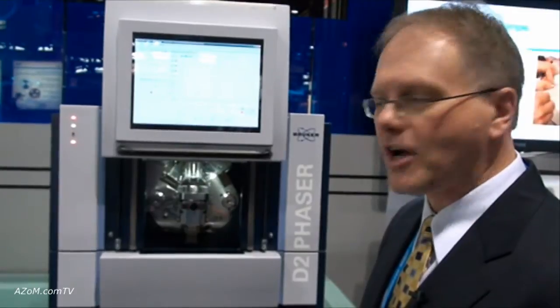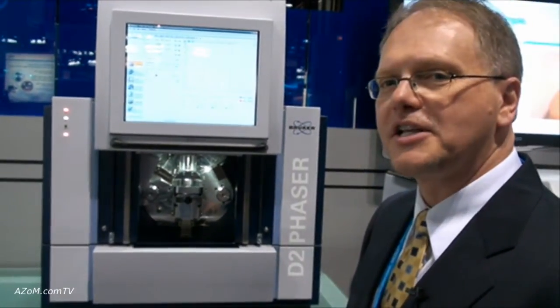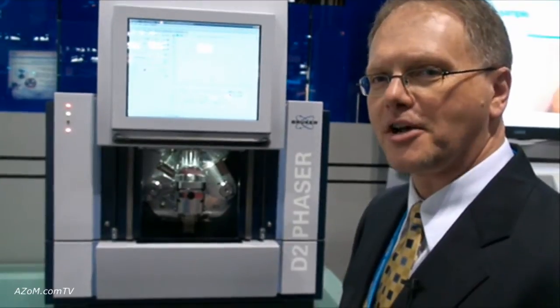Total weight is 200 pounds, easily transportable, and it runs off 110-volt power — no other utilities required. A very interesting addition to the benchtop market; really a market-changing approach to benchtop XRD.